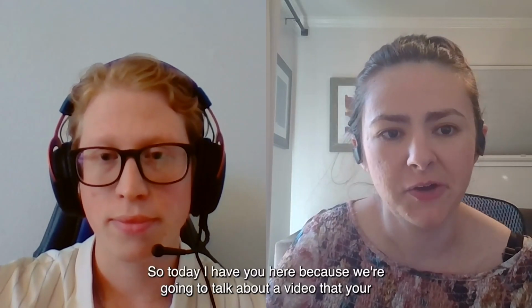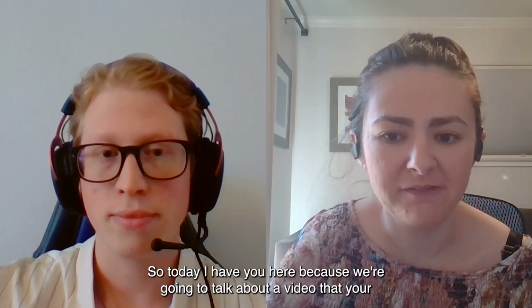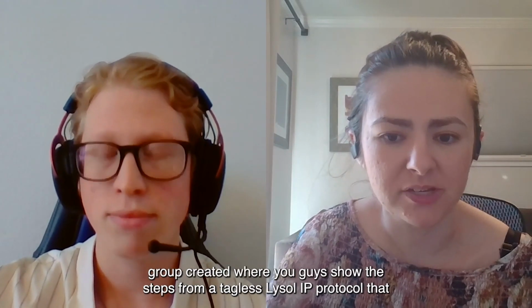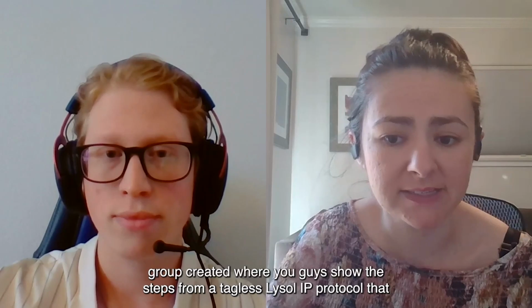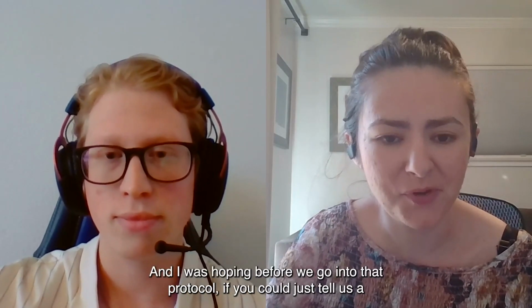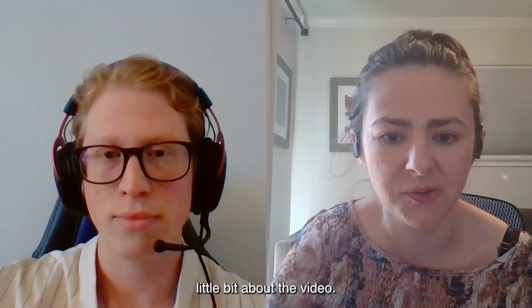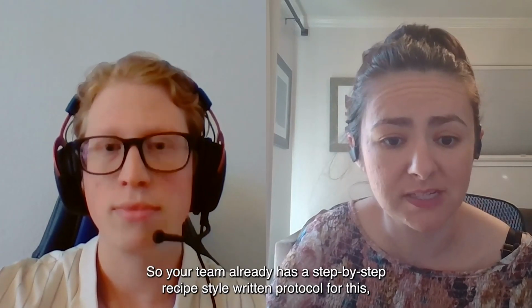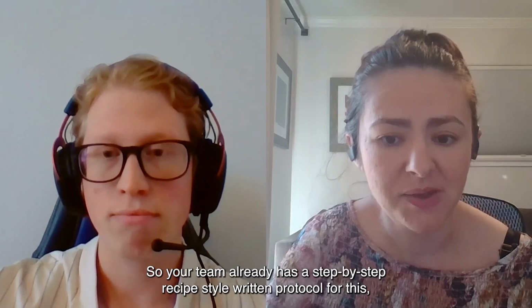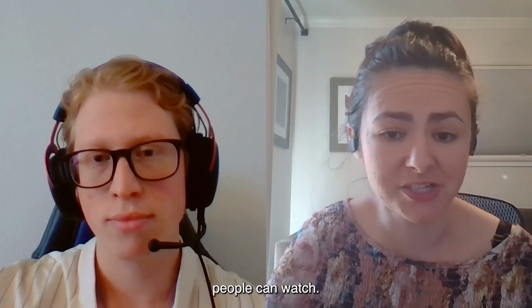Thanks, Dan. So today I have you here because we're going to talk about a video that your group created where you guys show the steps from a Tagless LysoIP protocol that your team developed. Before we go into that protocol, could you tell us a little bit about the video? Your team already has a step-by-step recipe style written protocol for this, but what was the motivation for actually making the video that people can watch?